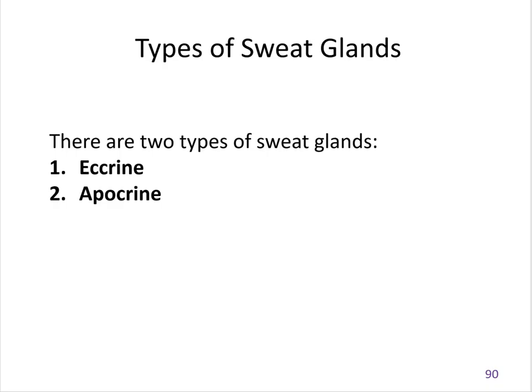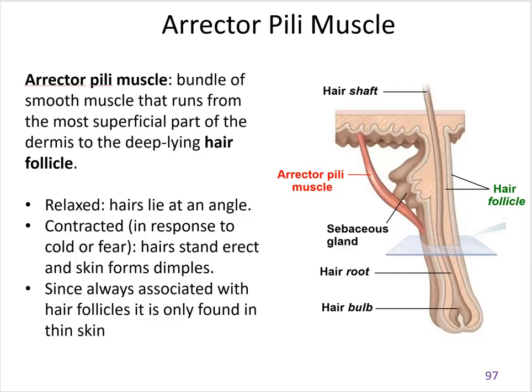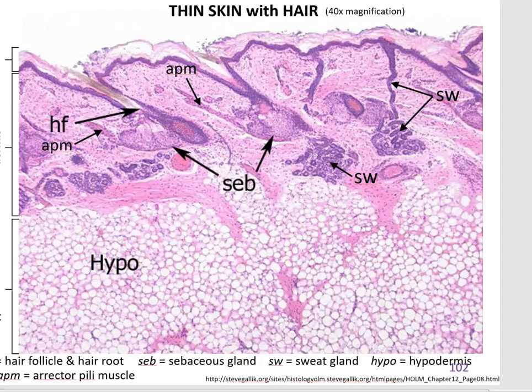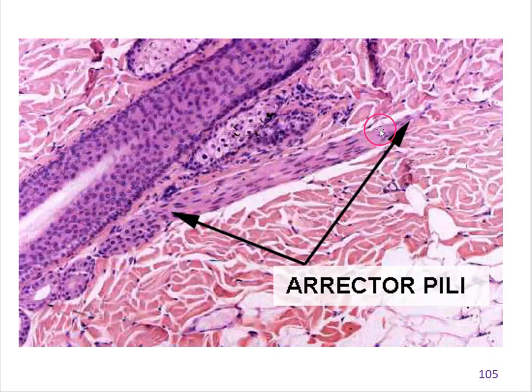And the slides go into a little bit about hair and the various things, but there's no substitute for histology. So this is some nicely labeled pictures. They're just not that magnified. Here they are a little better magnified. So sebaceous gland. Hair, and then erector pili muscle. Little erector pili muscle. Nice erector pili.